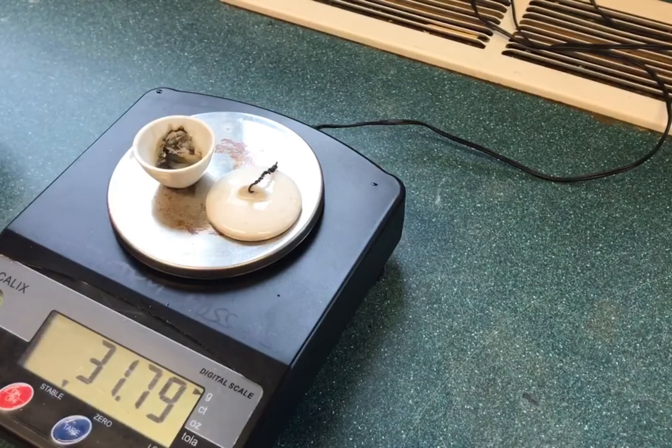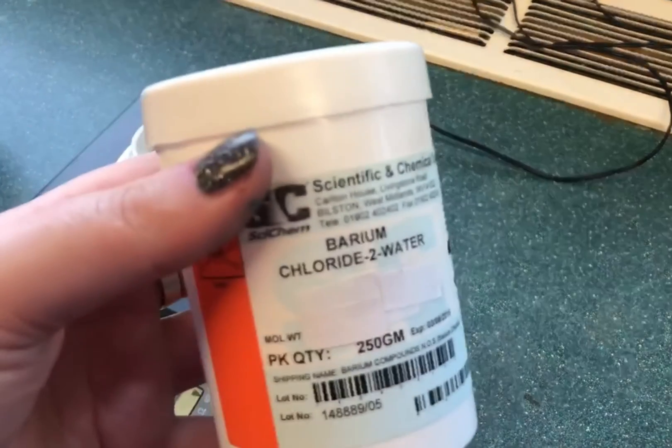The first step is to weigh a dried crucible. To dry a crucible you heat it strongly on a Bunsen for around 10 minutes. Here the crucible weighs 31.79 grams.